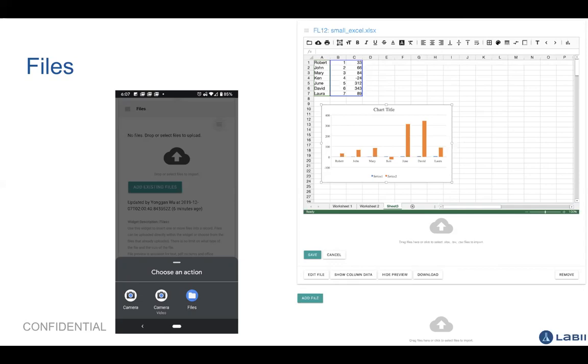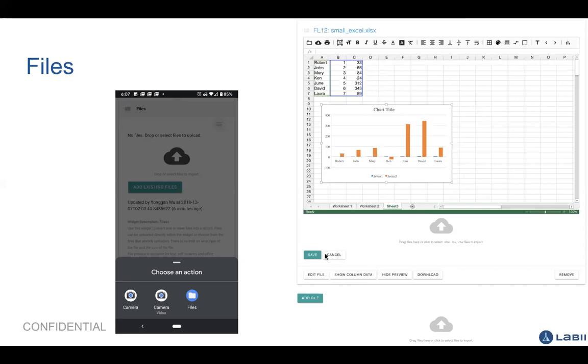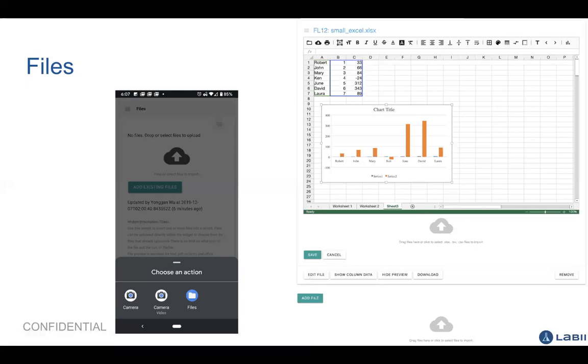You don't want to show the preview, so you can hide the preview directly. And then you can also edit this file. There are two different kinds of editing. Once you click "Edit" over here, you can change the file content. "Edit" over here lets you change the file version, like which version of the file you want to display. Of course, you can download it directly and then make further changes.